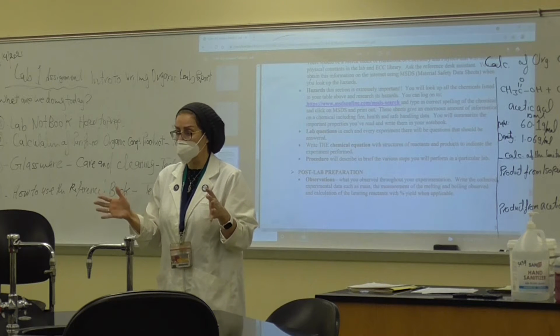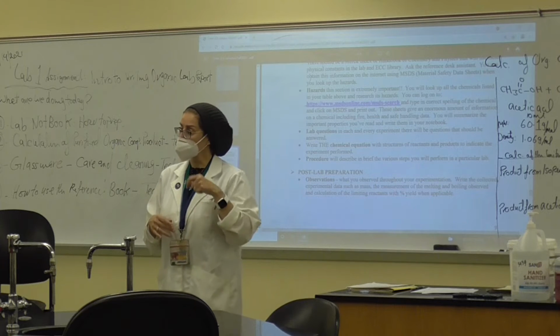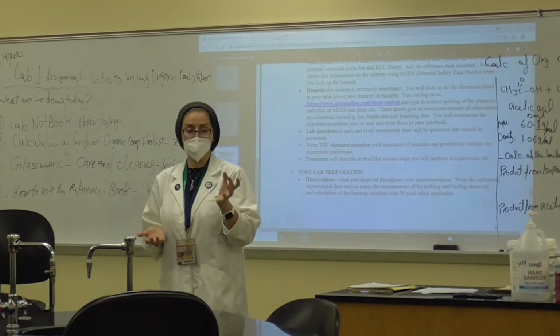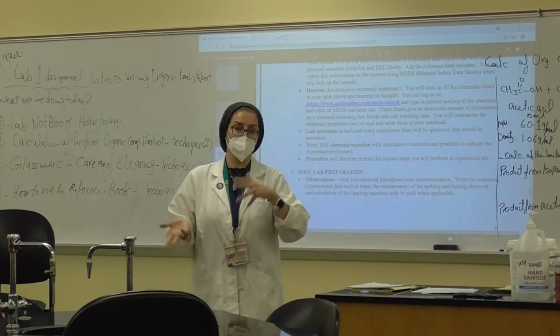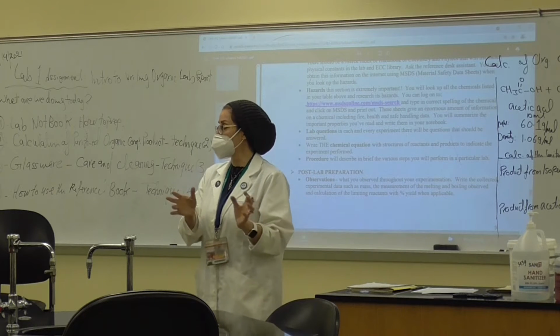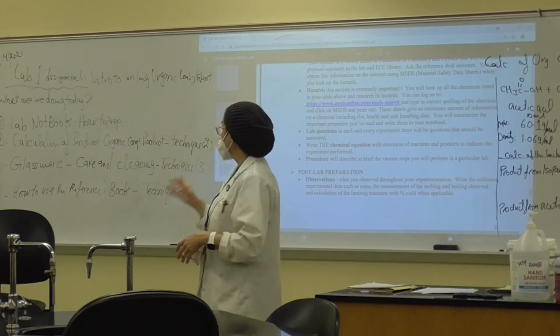It is micro scale and it comes in a kit. So we're going to go through the kit, and you check it, go through the inventory, and make sure that you have all the equipment required. If you have anything missing, please report it so we will be able to replace it at the beginning. And this is going to be yours for the rest of the semester.